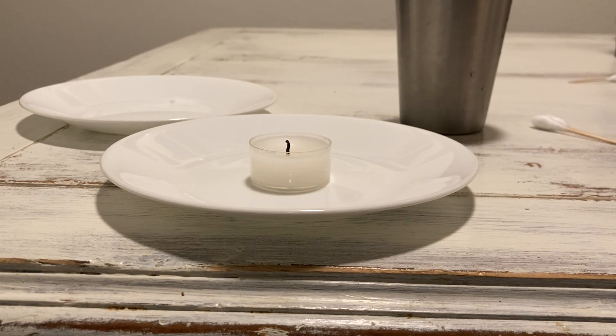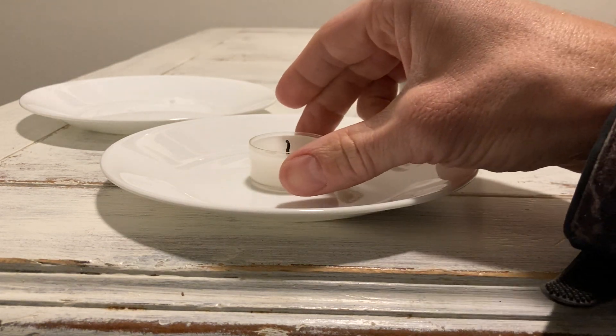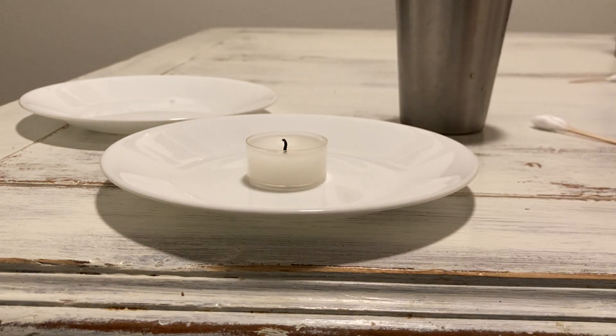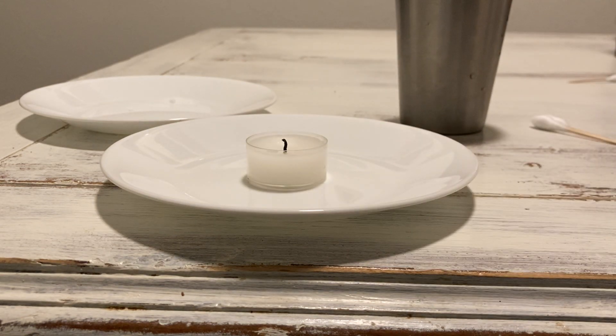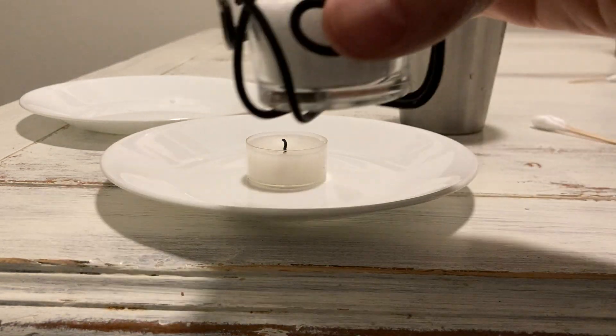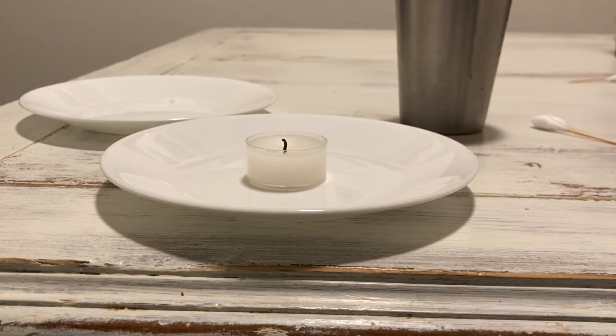We're looking at experiment 8.1, exposing different elements — really different salts — to fire. Our materials include a plate to hold the candle, a tea candle, another plate, and I've got my salt ready. I put regular table salt right here on the plate, closest to me.